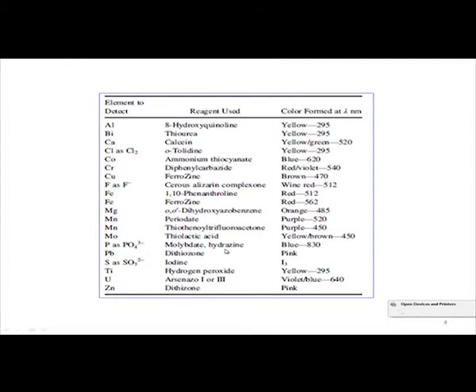With molybdate, we basically form molybdenum blue in the medium, and this formation is assisted by the phosphate ion, because molybdate, MoO4, is very similar to phosphate. The phosphate is trapped by the molybdate, and a characteristic blue coloration forms, which has a lambda max at 830 nanometer.